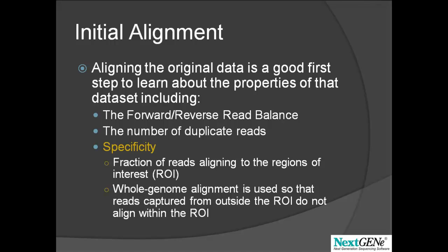Specificity can be calculated using the expression report as discussed earlier. Knowing the specificity helps to make a more accurate estimate of coverage across the captured regions in order to optimize settings for the condensation tool.